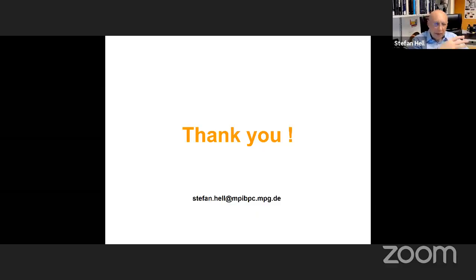This can be sorted out by playing all kinds of tricks and making it better, and using better dyes that are specialized for MINFLUX, which we haven't used. I'm not saying that Alexa is the best dye. Of course not. Why did we use Alexa 647? Because we didn't want to do two experiments at the same time. And we knew that this is a dye that gives enough photons to develop the concept. But it doesn't mean this is the best dye for MINFLUX. It's good enough to find out what precision you can achieve, because it gives you enough photons, gives you time. So this is another challenge.